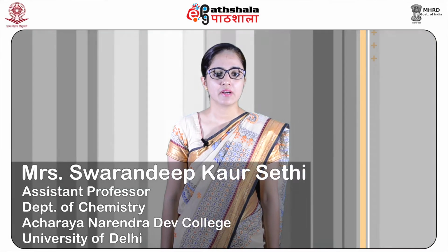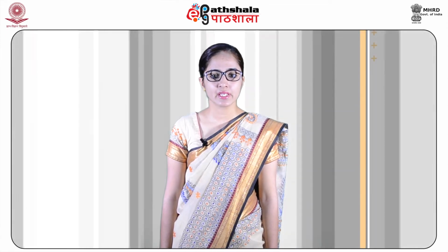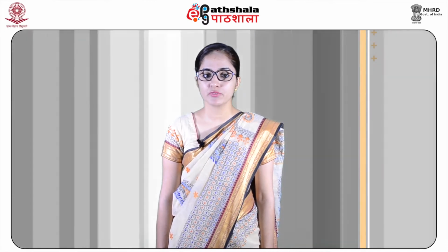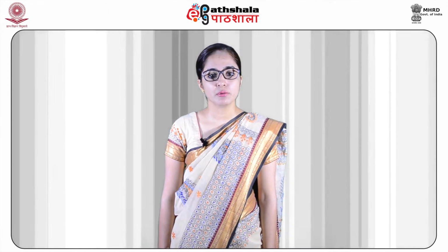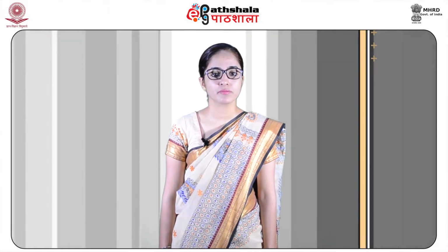Dear students, after studying this module, you shall be able to understand the underlying concept of nuclear magnetic resonance spectroscopy, elucidate the structural information through NMR spectroscopy, understand the number of signals of an unknown compound obtained from its NMR spectra, know about the spin-spin coupling or splitting, understand the proton NMR chemical shifts for common functional groups, know how to elucidate an unknown structure of a compound, and learn NMR spectroscopic applications.